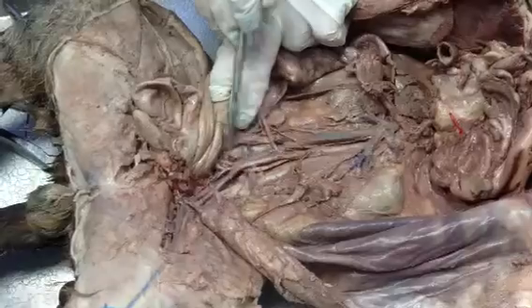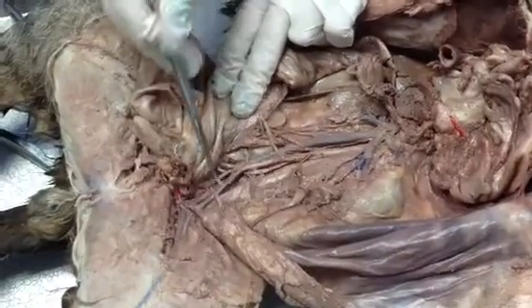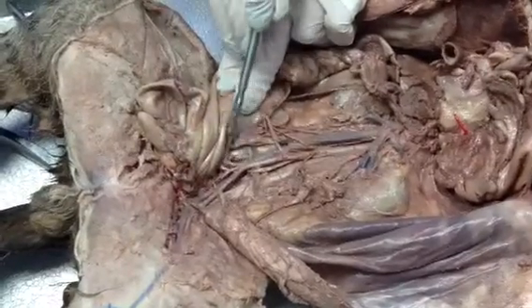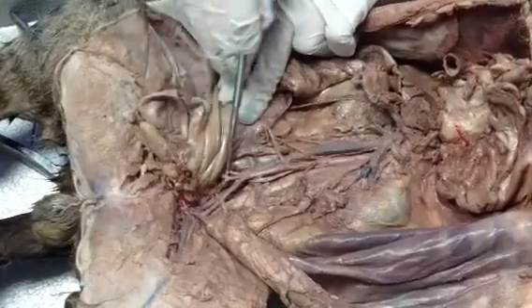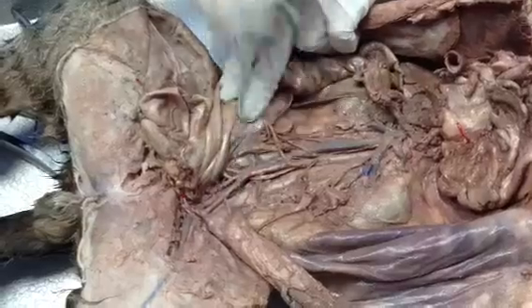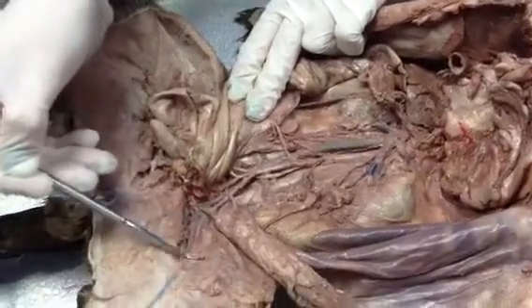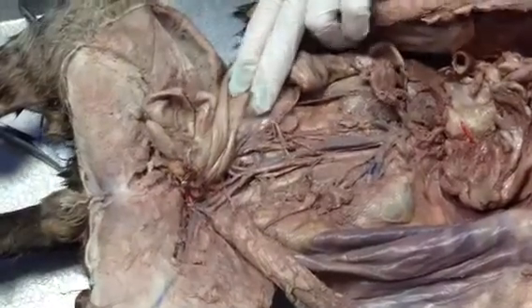And then down here you see a branching again. Branching here means we have iliacs again, all right? Here's a little bit easier. The top ones, the big ones, those are the external iliac arteries. And the smaller ones right underneath, those are the internal iliac arteries. And same vessel here again, and as soon as we get into the leg, that will be then the femoral artery. And that's it.